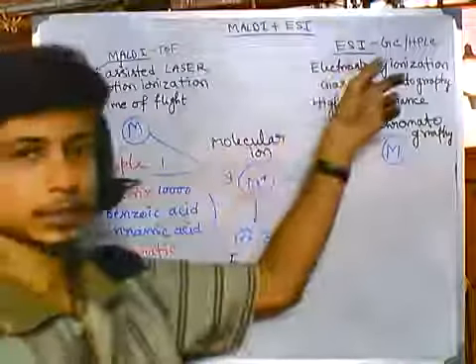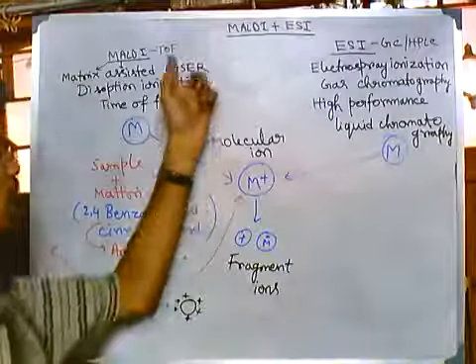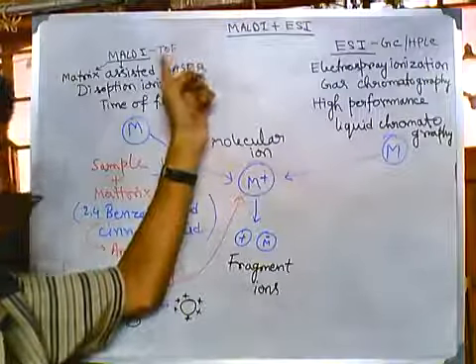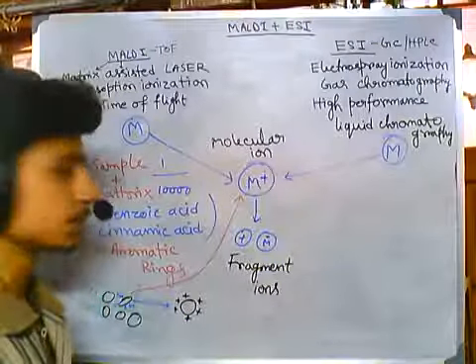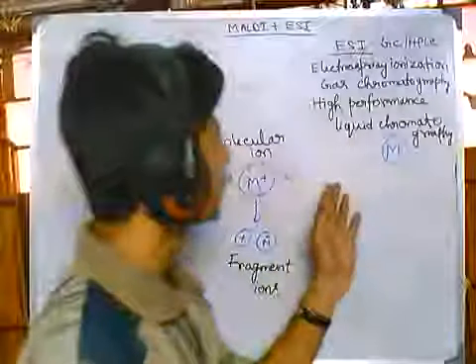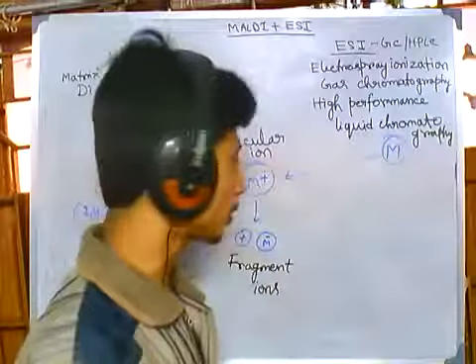Okay, now let us look at the ESI process. Now this is a simple process. We can utilize it with different analyzers. TOF is time of flight. This is a type of analyzer and detector that we can use. And after using it, we can look at the graph that is provided to us. Okay. Now here, in case of ESI or electrospray ionization, the process is different.